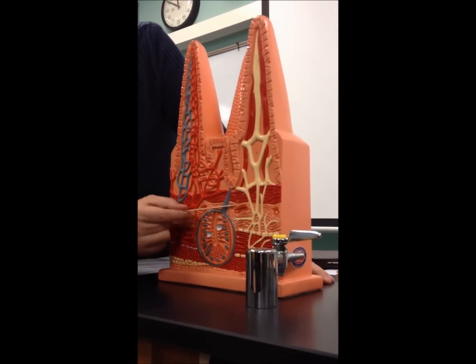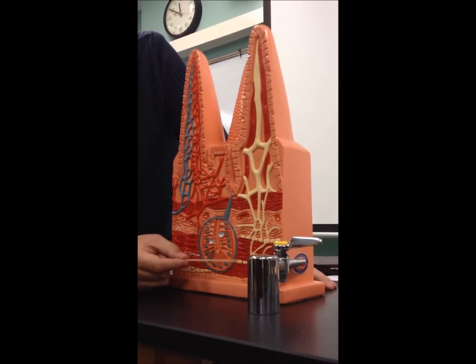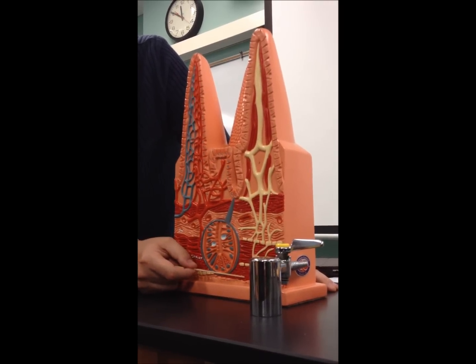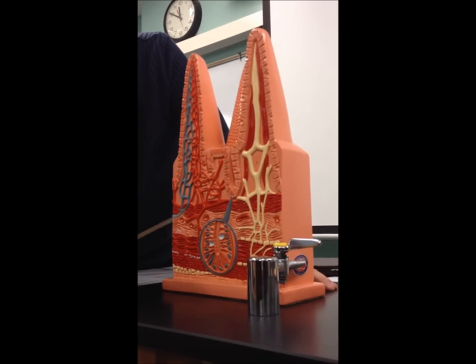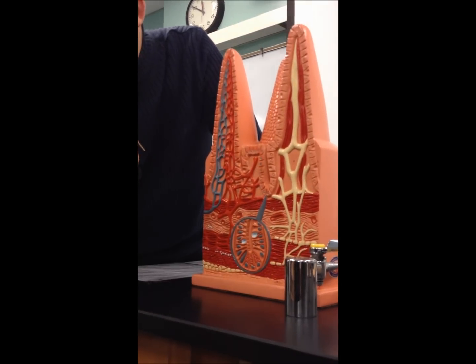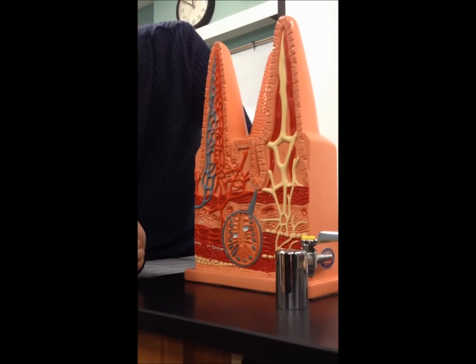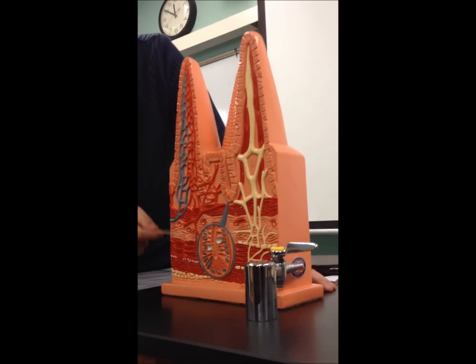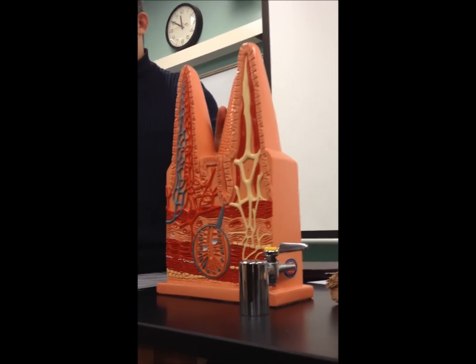Under the submucosa, you have the muscularis externa, with two different kinds of fibers, circular and longitudinal. After the muscularis externa, you have the serosa. These yellow patches are lymphoid follicles. These white patches are nerve plexus. The nerve plexus in the muscularis externa is called the myenteric plexus, and in the submucosa it's called the submucosal nerve plexus.